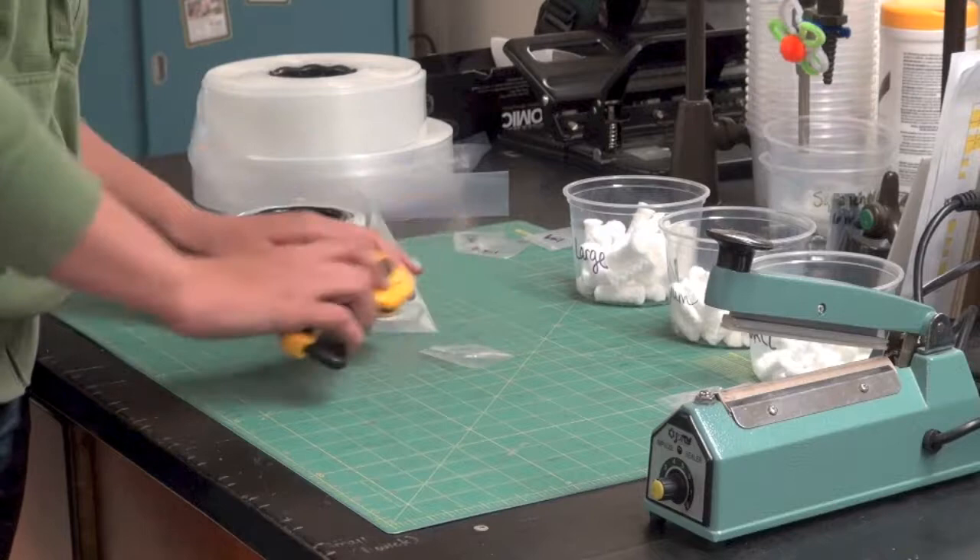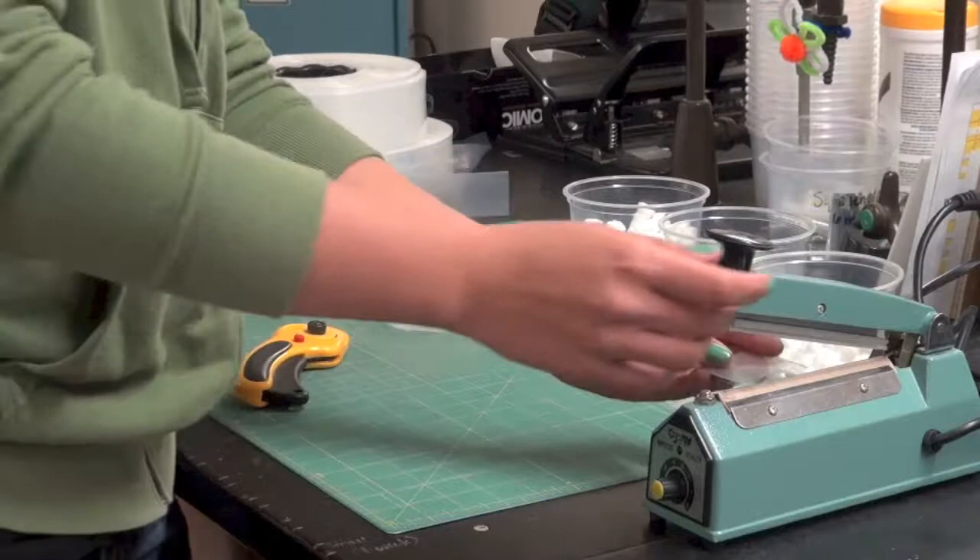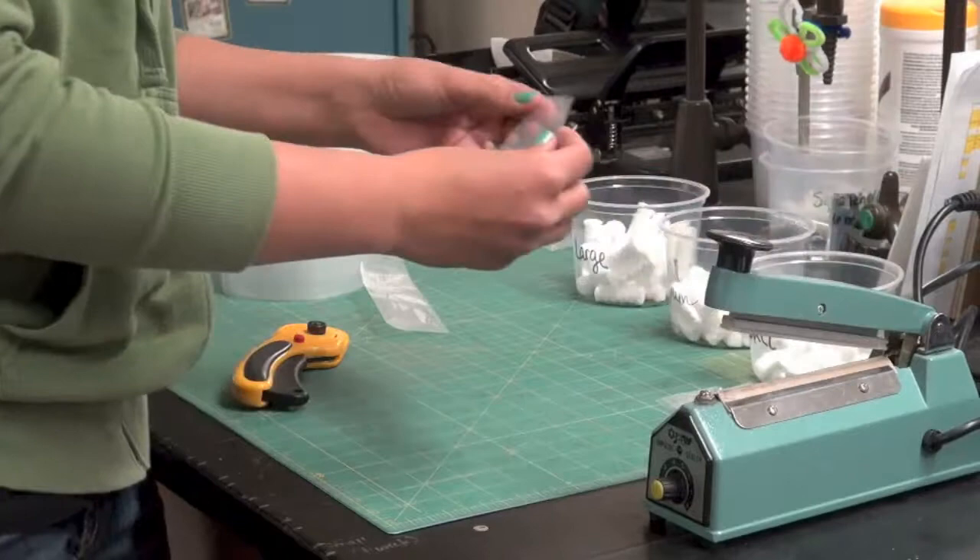Cut a 2 inch long segment of your chosen tubing. Since both ends are open, you will need to close one end. Do this using a heat sealer. Once sealed, insert the desired size of dental wick and now you are ready to add your chemical.